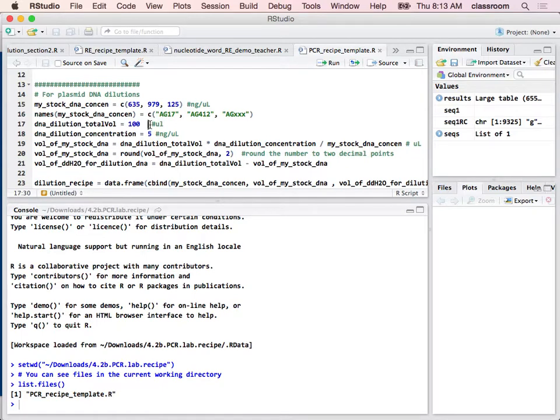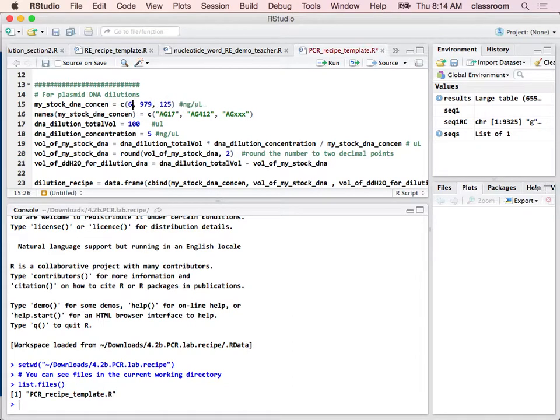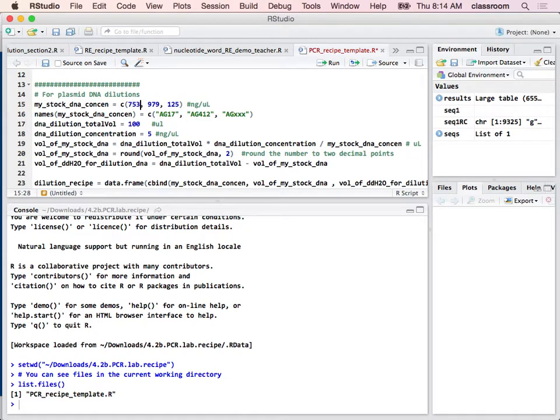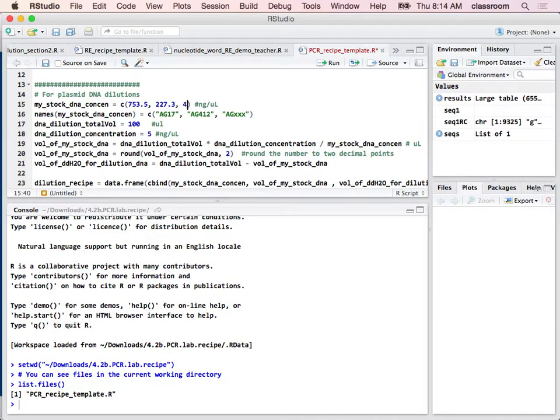And the protocol asks you to make 100 microliter. And you need to put some concentration, your original concentration. So here, I'm going to say, what I see is one student is 753.5. The other one is 227.3. The other one is 496.8.